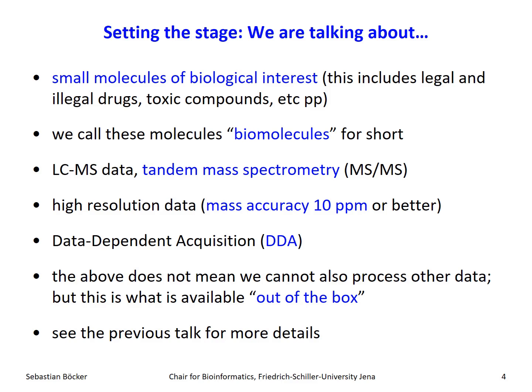And all of that, again, is what we can process out of the box. So our software Sirius can handle such data and give you these analysis results. If you need something different, something special, we also have other things available, like we are working on separating, say, chimeric spectra, but this is not implemented currently in Sirius, and you would have to contact us for that.